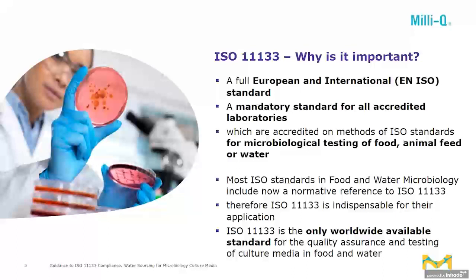Most ISO standards in food and water microbiology now include a normative reference to this ISO 11133 for the preparation and testing of culture media. Normative means that the ISO 11133 has to be used beside the other standards for food and water microbiological testing, for example, besides the Salmonella standard or Listeria standard. Therefore, the ISO 11133 is indispensable for their application. And ISO 11133 is the only worldwide available standard for the quality assurance and testing of culture media in food and water.